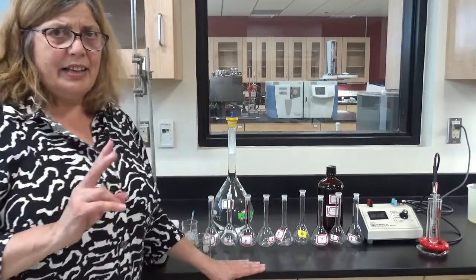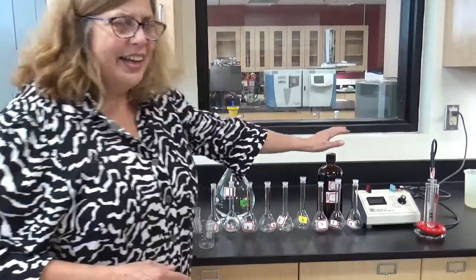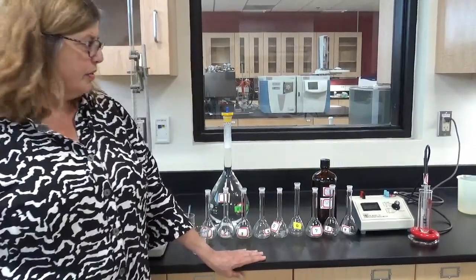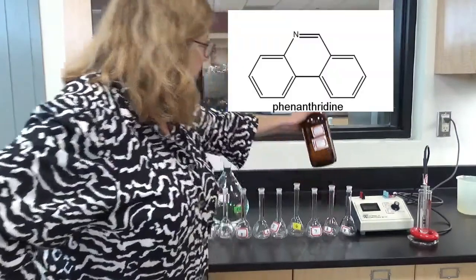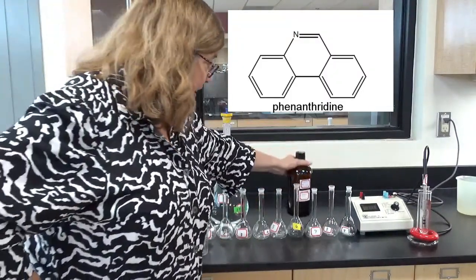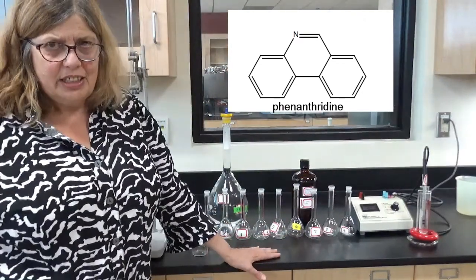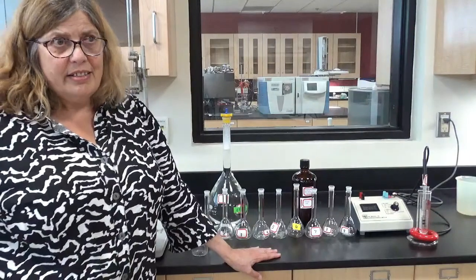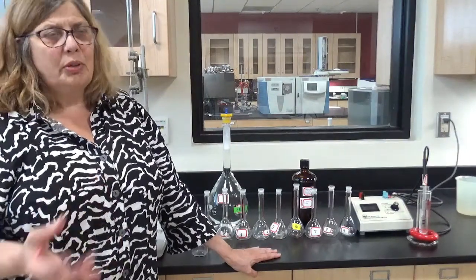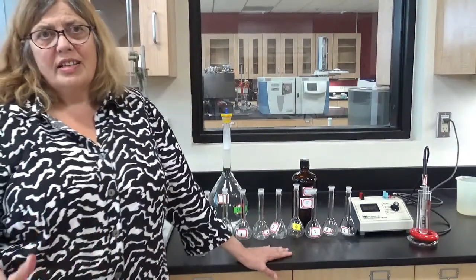All right, what's the second method? I said there were 2. You'll notice that I have another bottle here, okay? And what I'm going to be doing is adding 4 milliliters of this solution. This is phenanthridine, and it's a pretty dilute solution. It's about 7 times 10 to the -5th molar. But the thing about that phenanthridine is it fluoresces, okay? So if I were to take a solution of the phenanthridine, I could put it in the fluorescence instrument, the fluorimeter, and I could measure its fluorescence intensity.